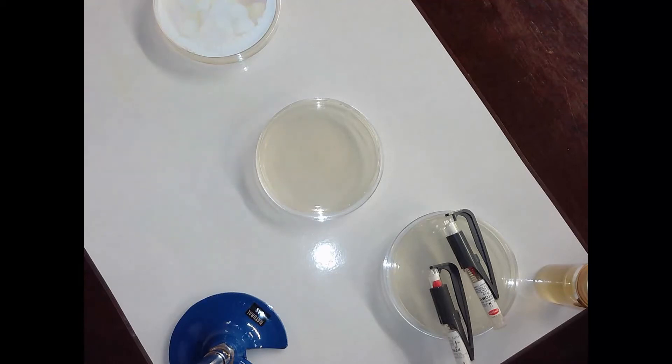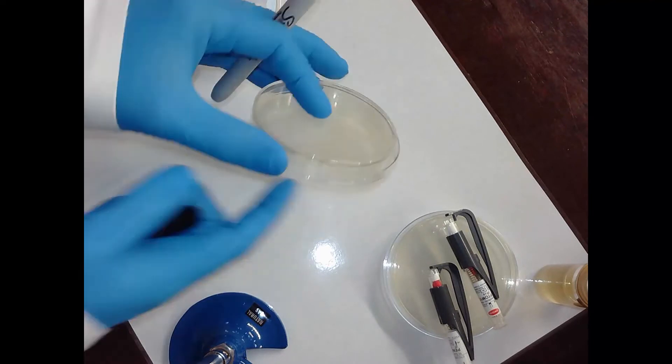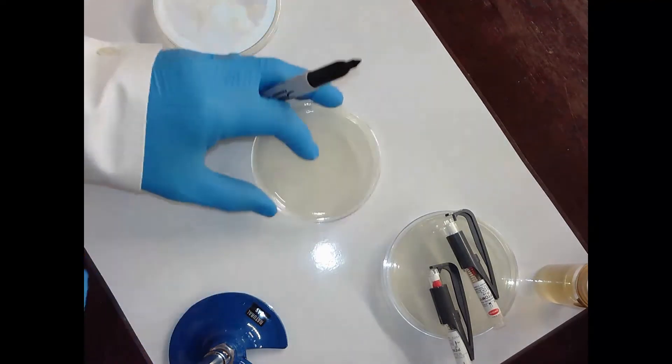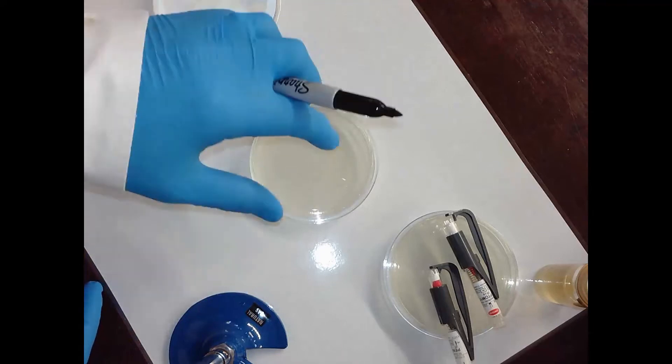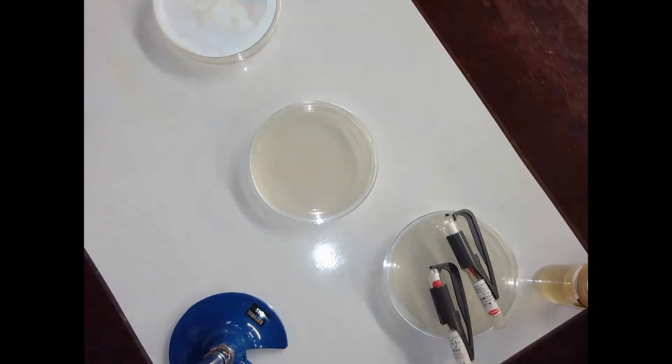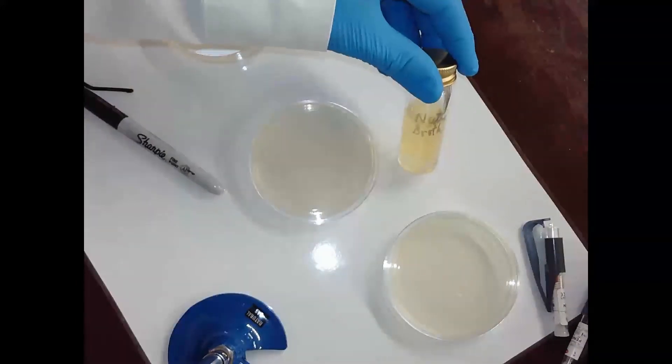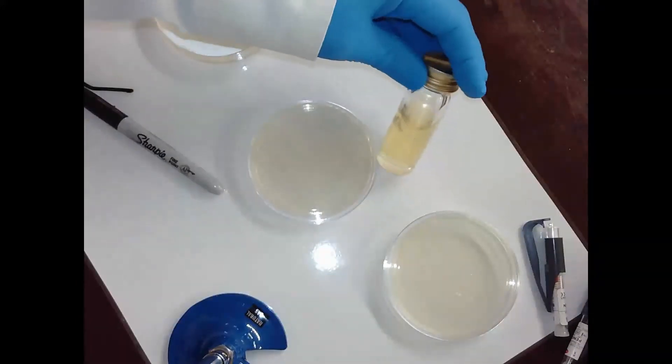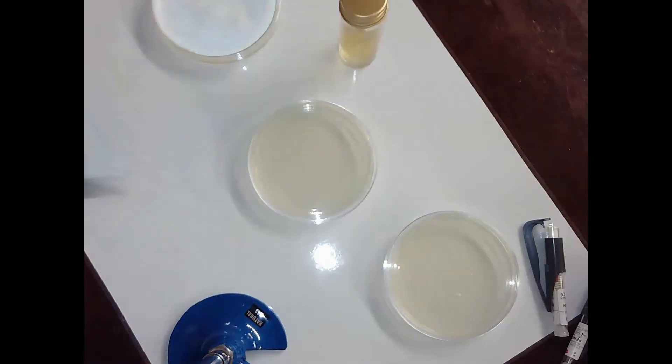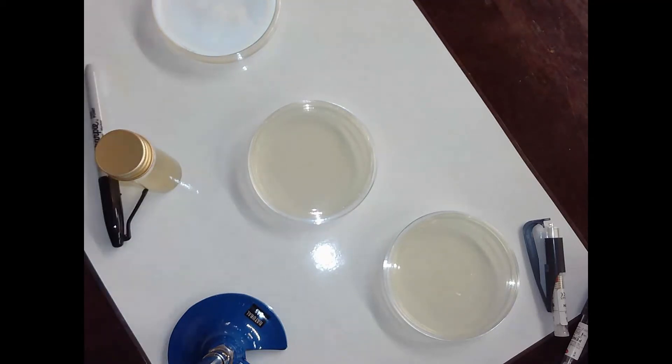I'm going to write on the base. The reason I write on the base is you never write on the lid because if I drop it the lid can come off, but if I write on the base then I'll know what I'm looking at. I'm going to spread this nutrient broth but this broth contains E. coli.